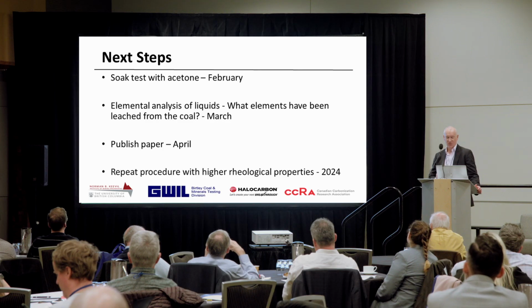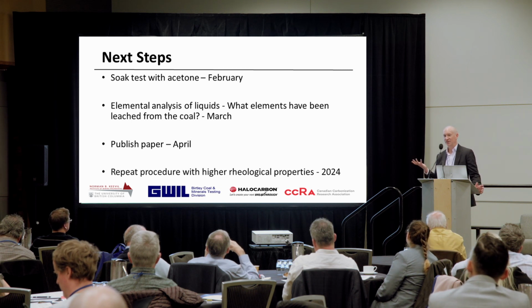So next steps going forward here into the future, we're actually going to do a soak test with acetone. None of us have ever done that. So out of curiosity, we're going to see what we get. That's going to happen in February. We are going to do an elemental analysis of what was remaining in those fluids, where chlorine is clearly there, but like what else is getting lost in those fluids. Intention is to publish a paper in April.